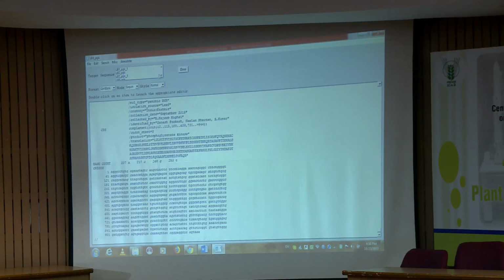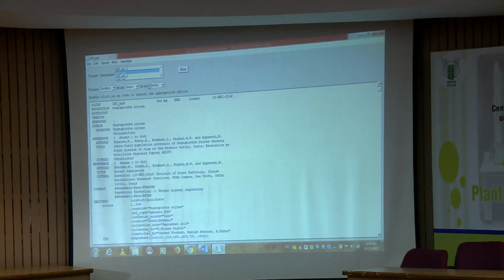Now, if I change this, let us suppose this was for sample number 1, this will be sample number 2. Once your file is ready, let's suppose you want to make some editing. Suppose you missed something, or you have wrongly entered anything. Suppose I need to change the author name.